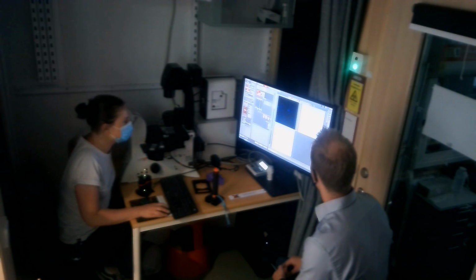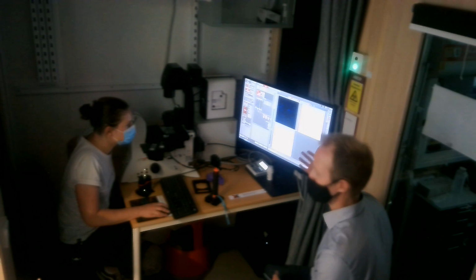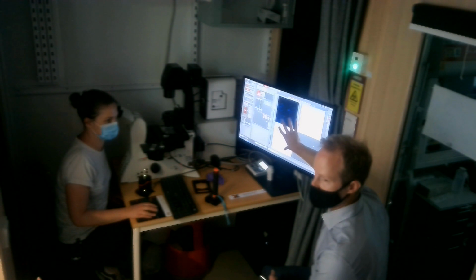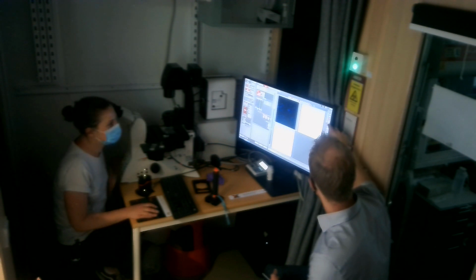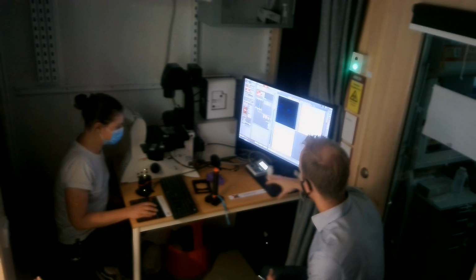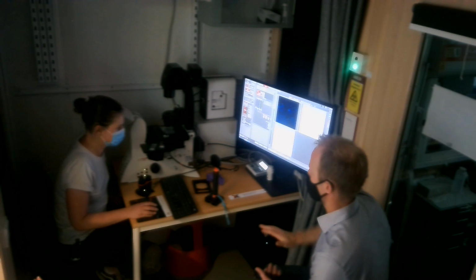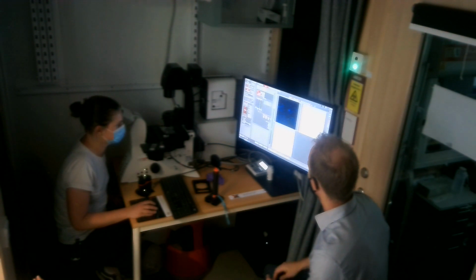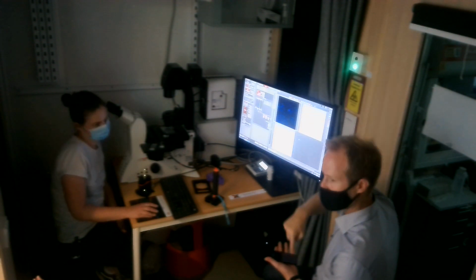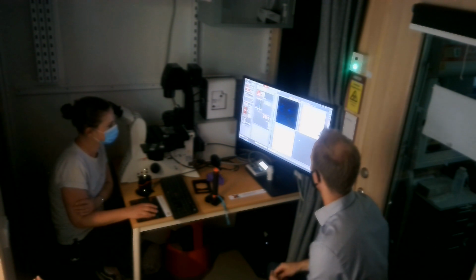Here we can also have a quick look at how we can do a maximum intensity projection of this. When you have something this small, just one field of view, you can click on that button there, maximum projection. It takes a bit of work because it's calculating, and now this one is gone because everything collapsed down to one area. It's taking all the intensities from all the stacks, looking at one pixel through the stack and taking wherever that was brightest. So this is the result.